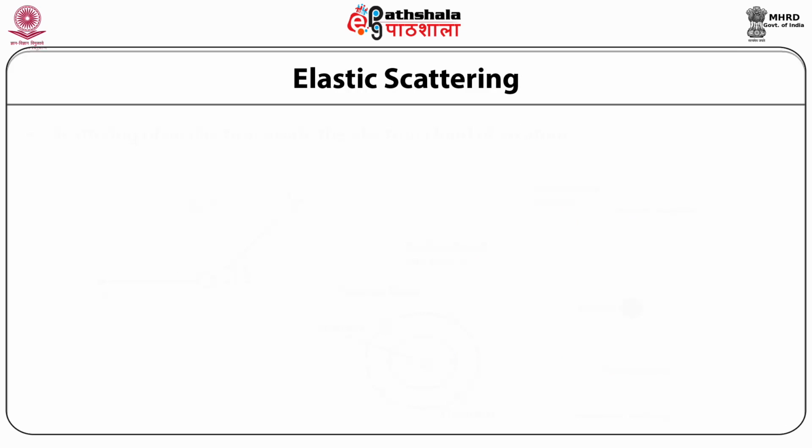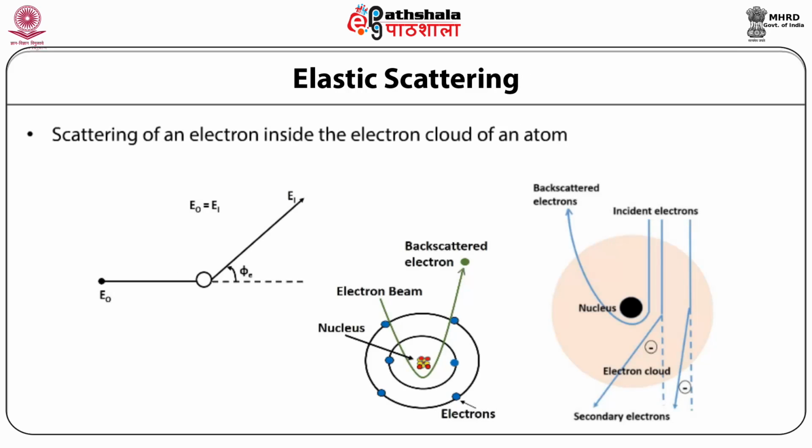The elastic scattering. The electron beam approaches the specimen and electrons with various energies interact with the localized atoms. During this process, the electron trajectory changes and it scatters.